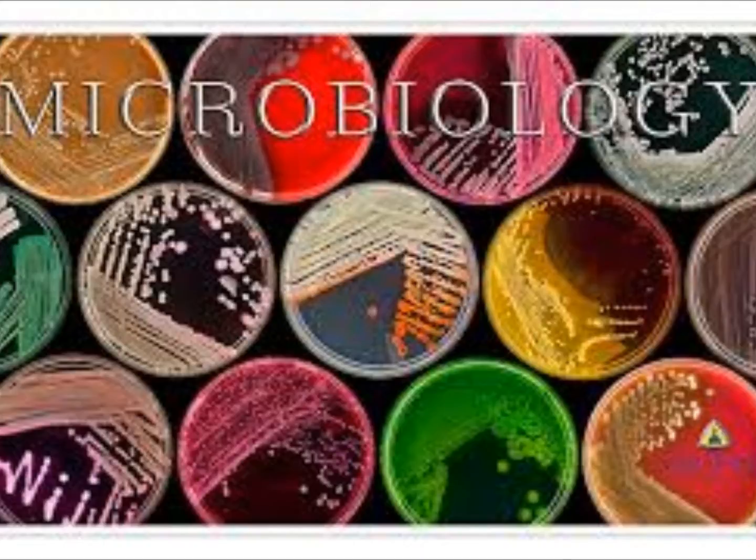I use the whole circle. Okay, has everybody got their slide drying? Did you drop the water, right? Mine's about there. I made it look like the QC. We need to go over the procedure tomorrow, since we only have limited time. So we'll go over the procedure tomorrow. I'll put this back. Sure, that looks like it'll do.